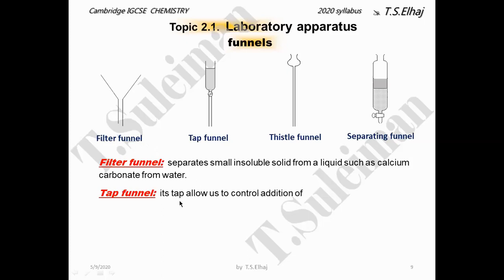Tap funnel. It's called a tap funnel because it has a tap. It allows us to control the addition of the liquid slowly, and we can add the liquid in portions. Small portions, not all the liquid at once.